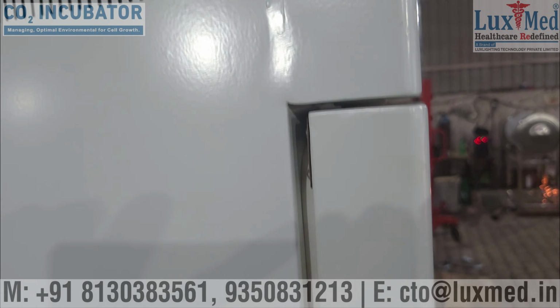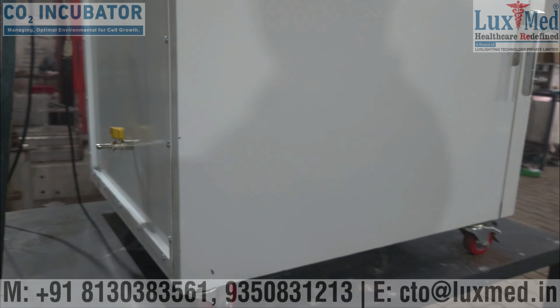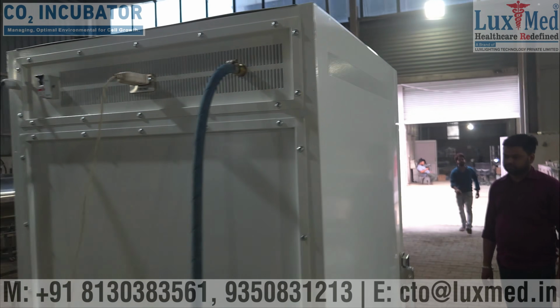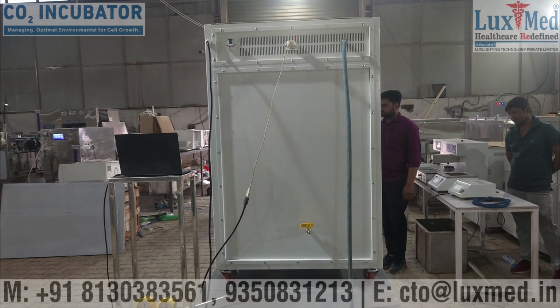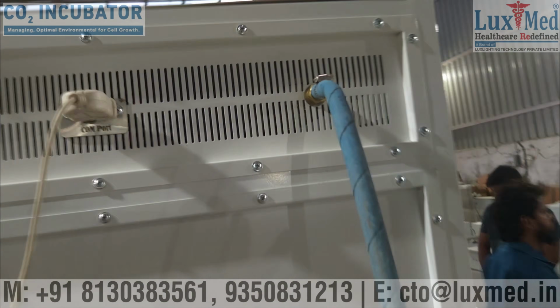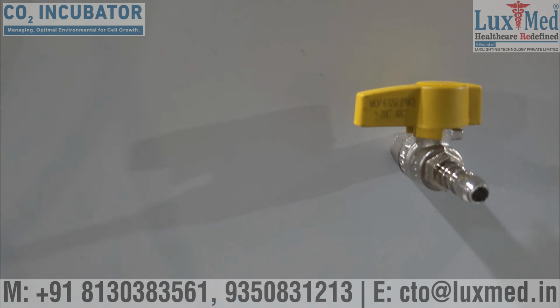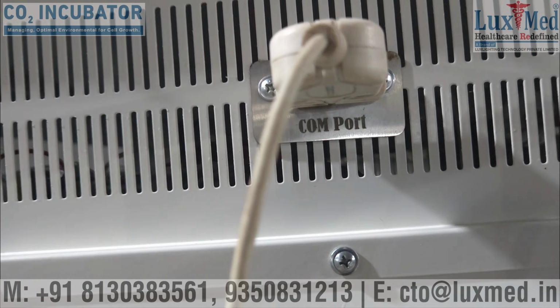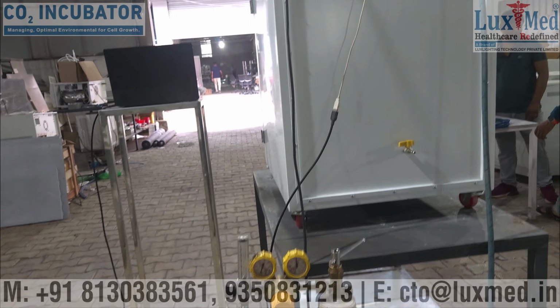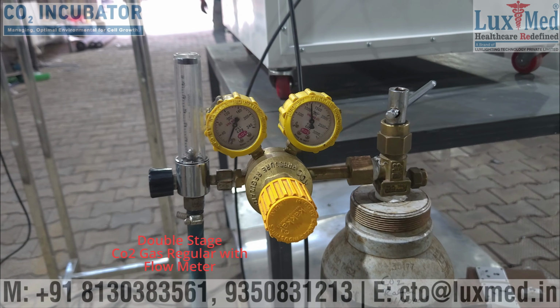Drug discovery and development. CO₂ incubators are used in drug testing and the development of new medications, as they allow for controlled cell culture conditions for drug screening. Tissue engineering. They are utilized in the development of tissue-engineered products, such as 3D cell structures for grafting or tissue repair. Research and development. CO₂ incubators are widely used in various research fields, including immunology, oncology, and cell dynamics.